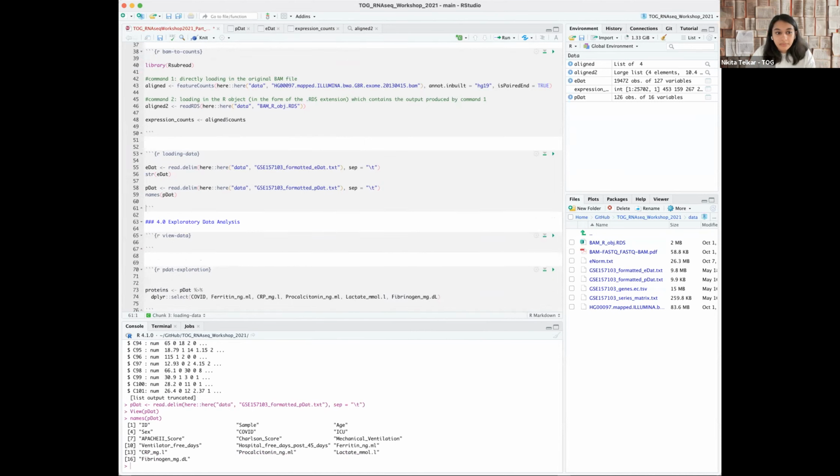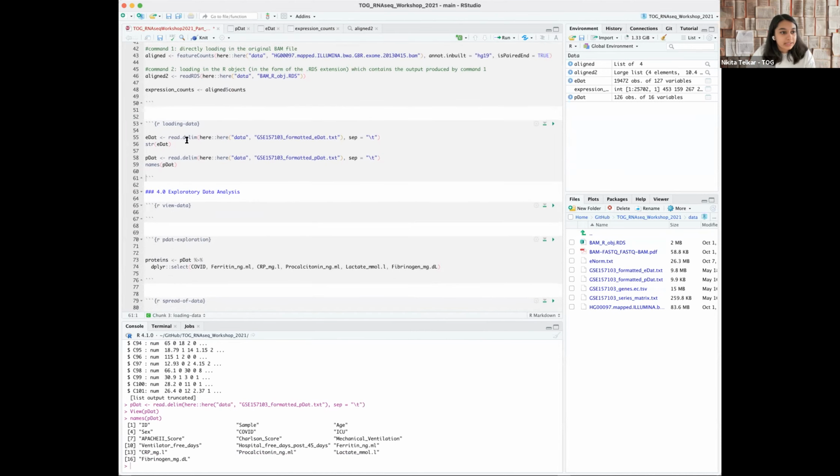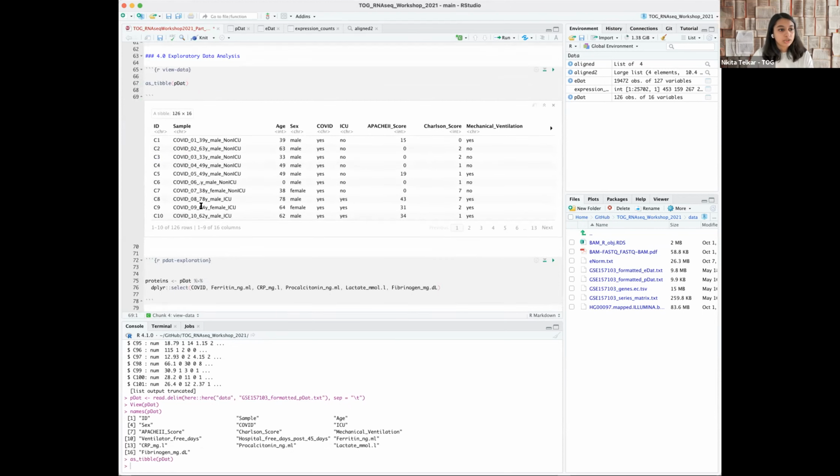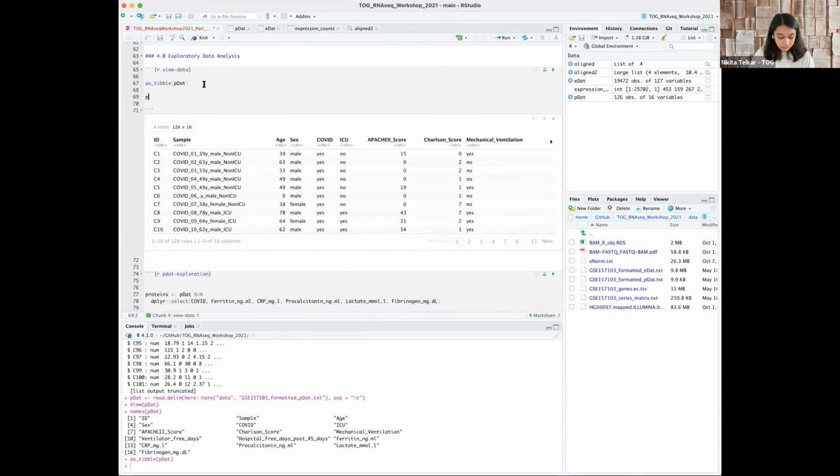From there, you can very easily view it as that, or you can do it as a tibble. The tibble package is also used for viewing data and working with data. I prefer to use data frames, but it's a user's choice. So if I do that, it just shows it to me like that. There are several different methods that you can use.